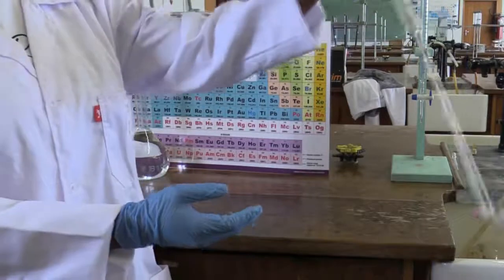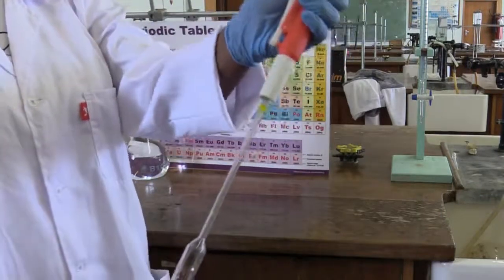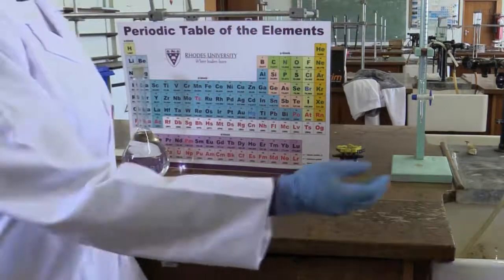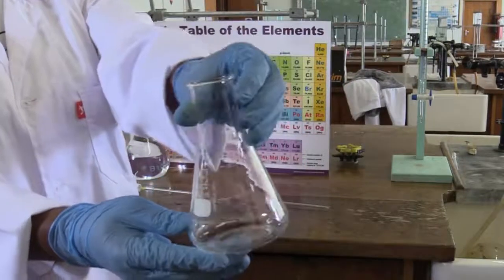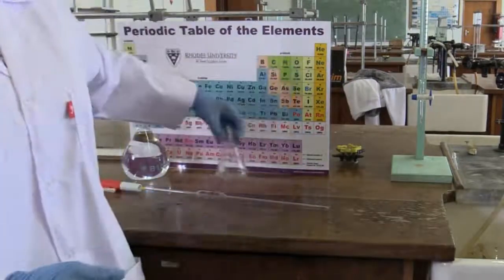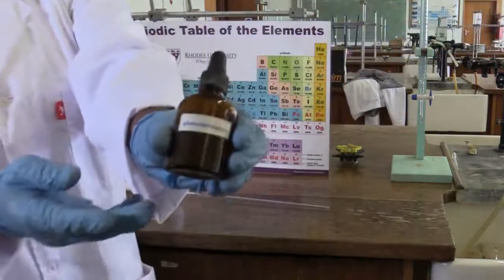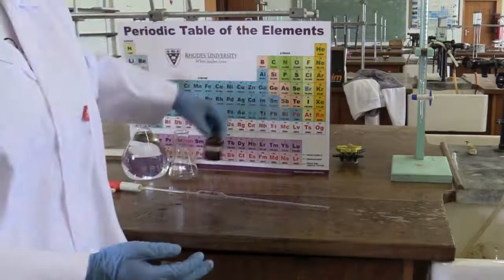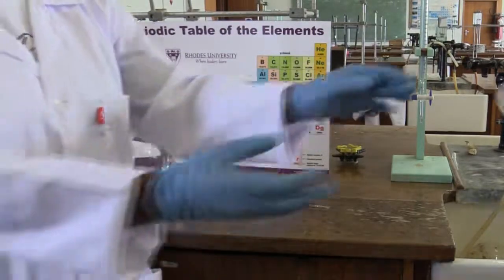We will use this pipette to measure exactly 20 ml of the solution so that the volume is known. We will place these 20 ml into the Erlenmeyer flask where the reaction will occur. 2 to 3 drops of an indicator, phenolphthalein in our case, will also be placed into the flask to allow for us to assess the endpoint of our reaction via a color change.